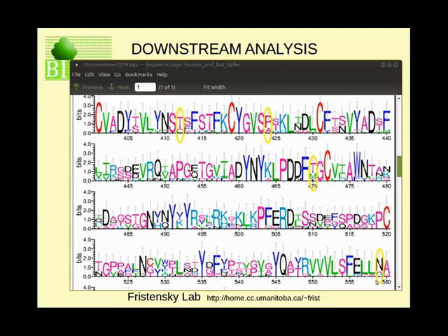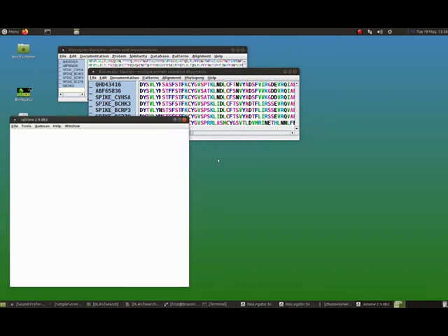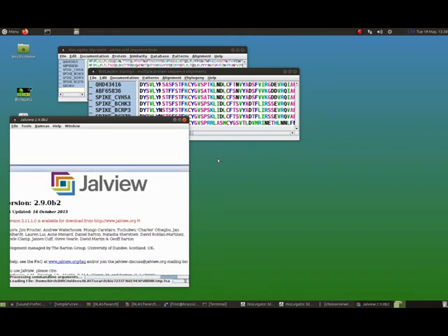And then at 559 in the alignment, we have asparagine in most of them, which is a bat-like amino acid, whereas you have a histidine, the very small letter H there, in the 2020 protein. Yet another way of examining a multiple alignment is to export the entire alignment out to Jalview, which is a very comprehensive multiple alignment viewer and editor.